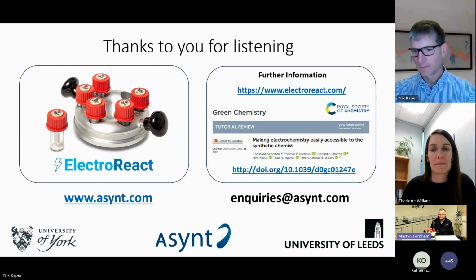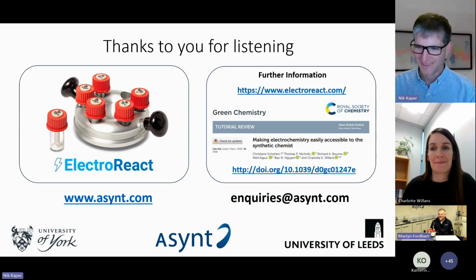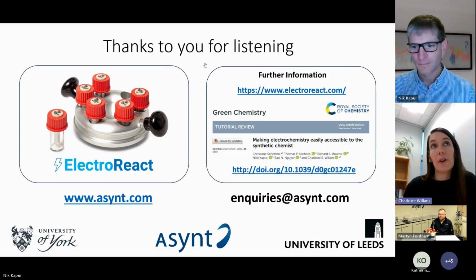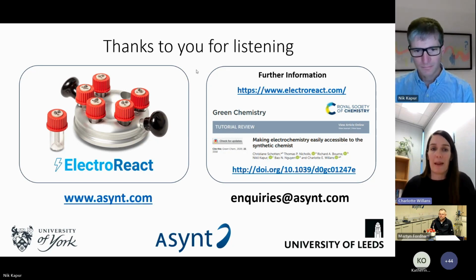Another question is, oh, sorry, I was just going to say I spotted another one there as well, but you go for it, Catherine. Thank you. Can immobilized catalysts be used too, or does the catalyst need to be in a homogeneous system? If you have your catalyst immobilized on a material that fits within those ports, then yes, an immobilized catalyst can be used. But I guess your support would need to fit within that slot that the electrode goes into.